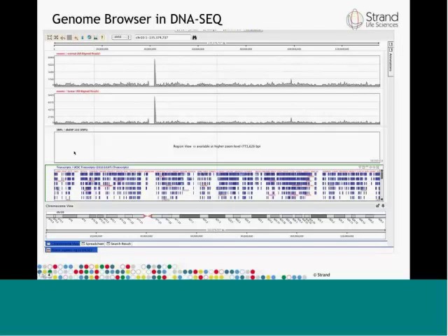Note that unlike in the previous RNA-seq experiment, here the dbSNP annotations are also shown by default, since it's quite likely that in a DNA-seq or a whole exome experiment, one is likely to be interested in SNPs. The data tracks again show the coverages of the 2 samples, and as usual, since no algorithm has yet been executed, there are no analysis results shown.